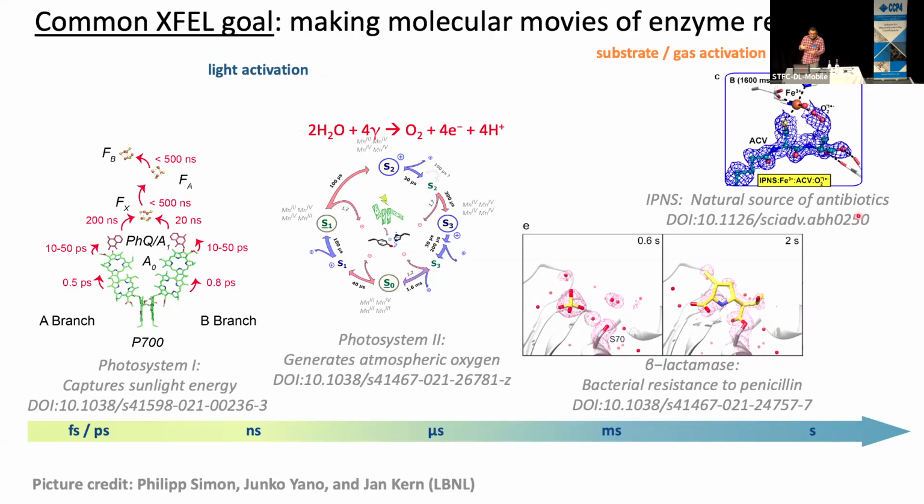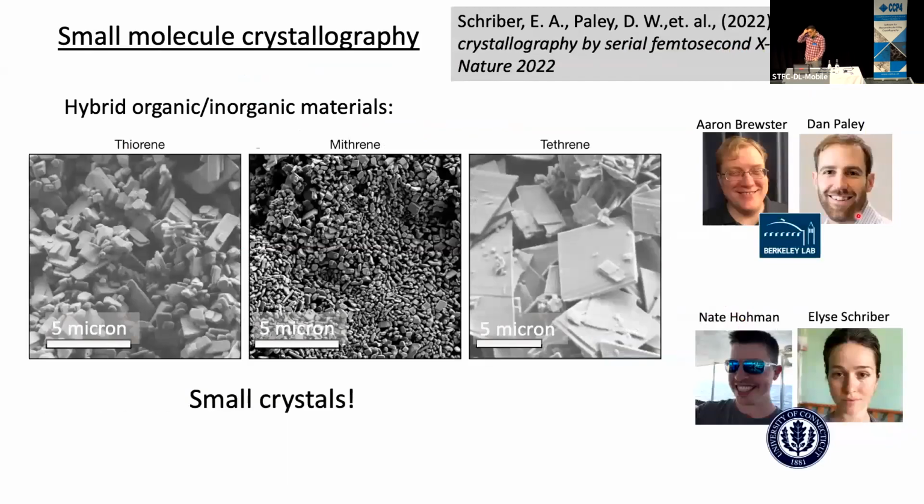So, when you have megahertz crystallography and you're getting up to 1 million images a second, you can imagine being able to really study dynamics systematically. Instead of going to the XFEL and getting 1, 2, or 3 time points in 2 days, you might end up with orders of magnitude more. So this, I think, will be really helpful for time-resolved work. But there are other kinds of experiments that you can imagine that would benefit from having high throughput.